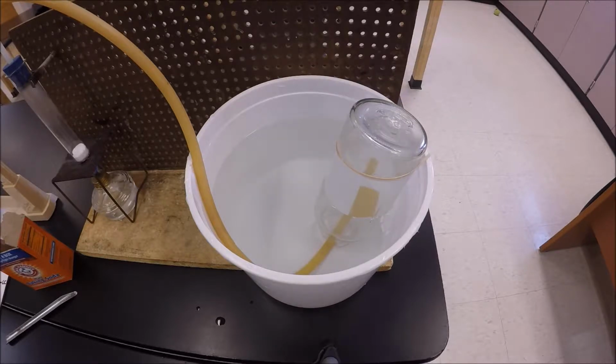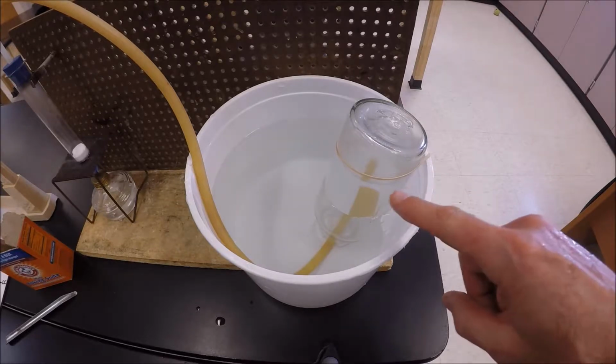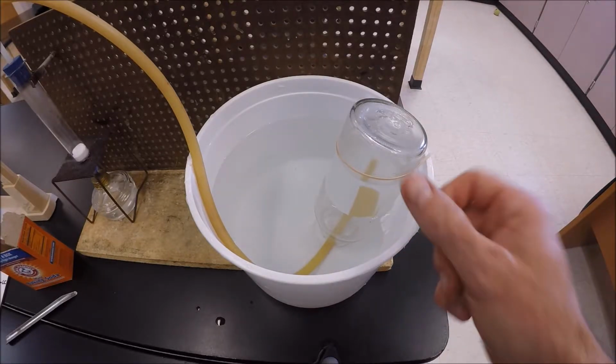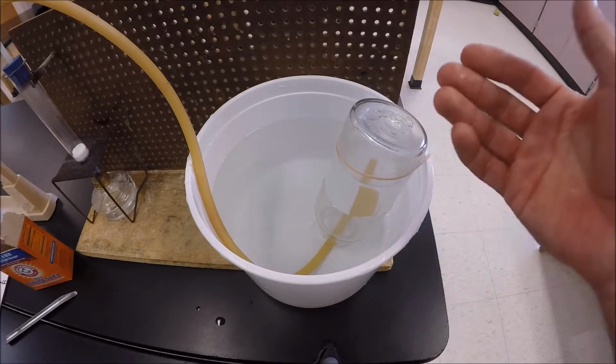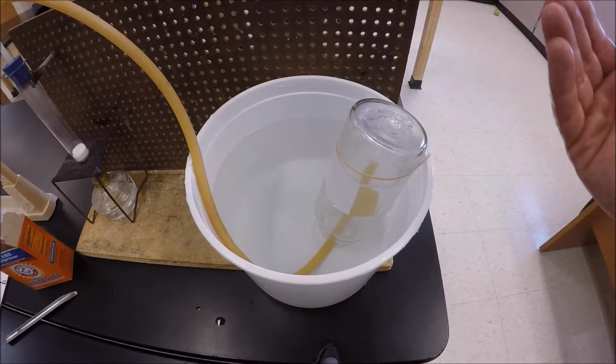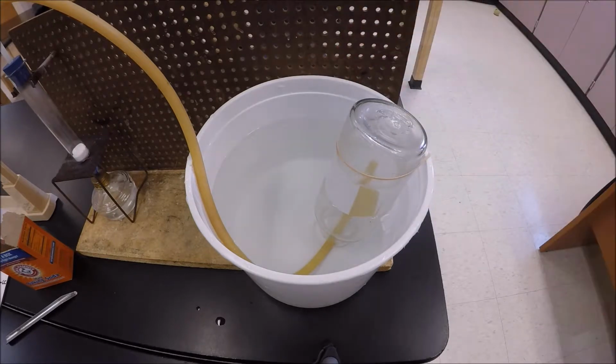I'm going to wait until that is about, like I said, maybe two-thirds full. I'm going to have to keep an eye on it, because once the level of gas goes below the top of the rubber tube, I won't be able to see the bubbling occurring anymore, because the gas is going to be released into the gas that's already in there. It's nice when it's going through the water, because you can easily see that. So I'm just going to monitor that for a few minutes. It doesn't take very long.